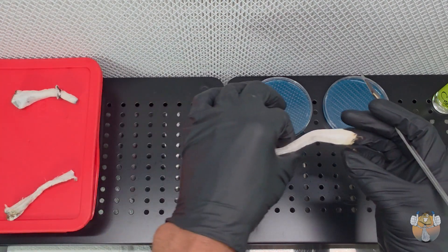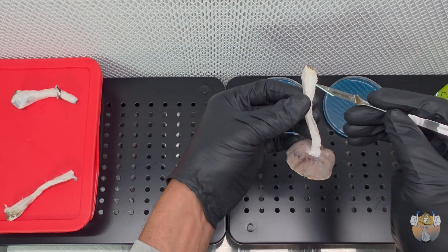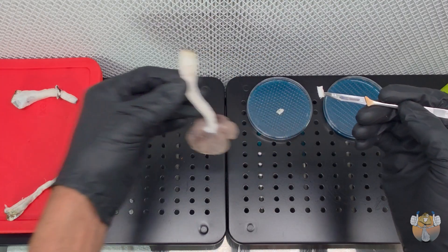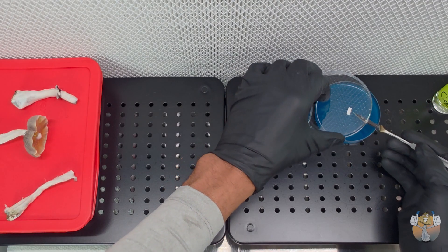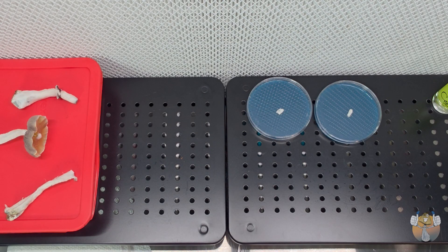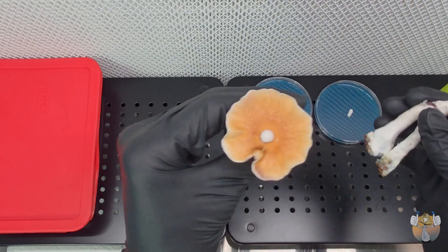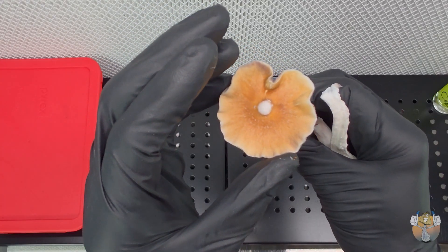Usually I would sterilize my blade and go back in, but since we used it one time and this is fresh, we're moving pretty quick — just go ahead and cut another very small piece right out of the middle, then transfer that onto our agar dish. Bada bing, bada boom, you're done just like that. Hopefully we can recreate this look over and over again because this is very pretty. I'm very proud of this cross — if you guys have any ideas on what this cross may be, drop it in the comments below.